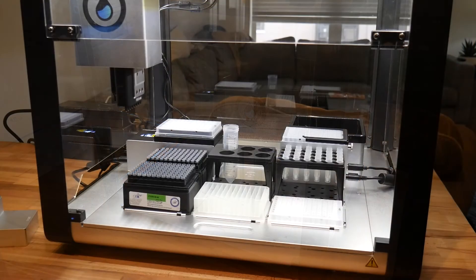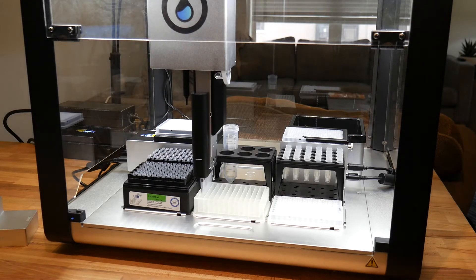The robot is capable of holding two pipettes at once. Many folks will choose to equip it with a single and a multi-channel so that they can access both tubes and work efficiently with well plates.